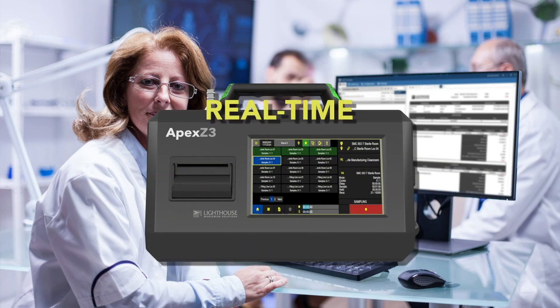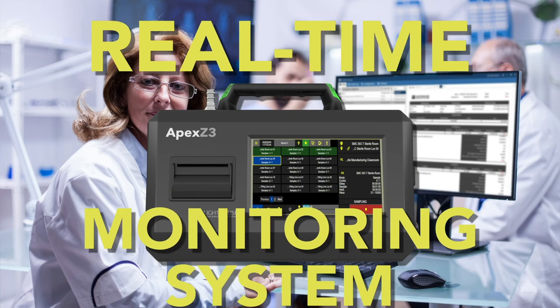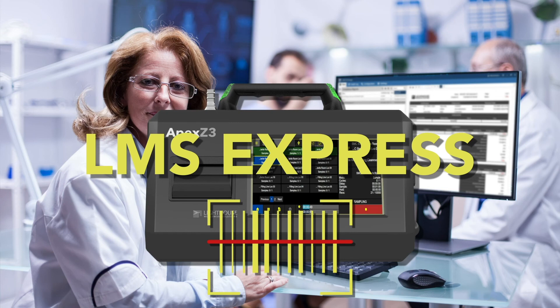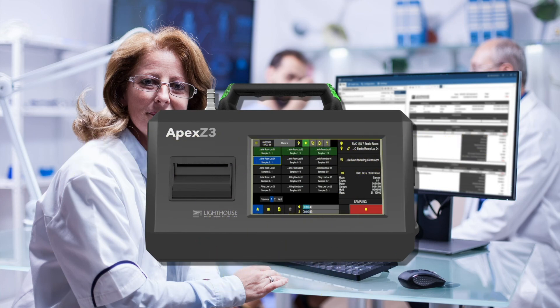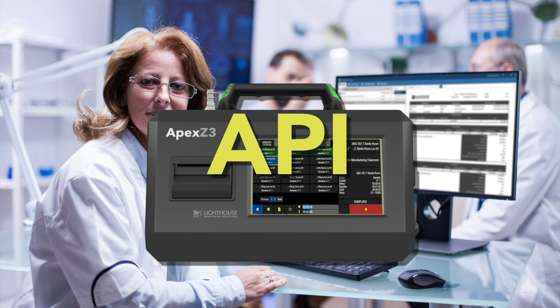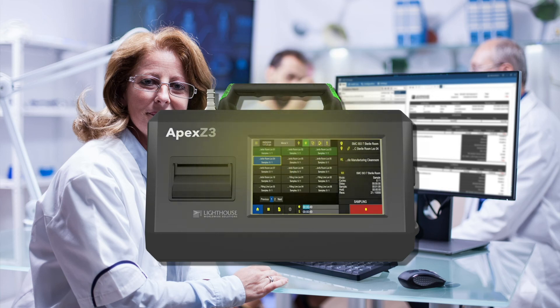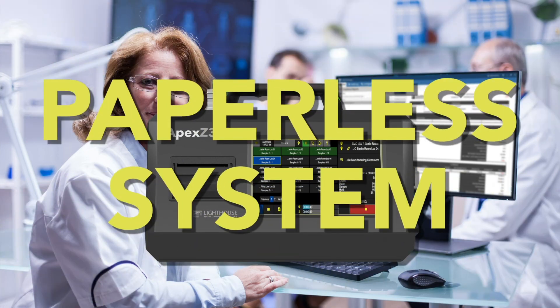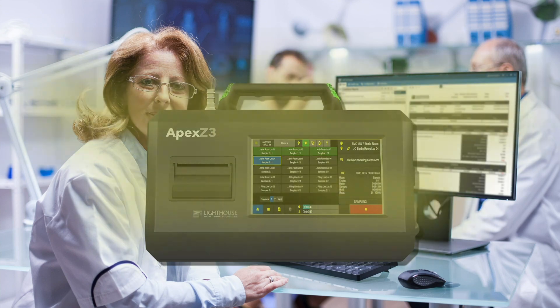Connect and integrate your Apex Z into a real-time monitoring system for more flexibility using LMS Express, or connect a barcode reader and integrate all sampling locations for an error-free process. Send your data files over your network effortlessly using common internet file sharing, or connect to a third-party database using our unique API system. With the Apex Z and Lighthouse Worldwide Solutions, you have several paths to a paperless system enabling you to save time, resources, and money while maintaining data integrity.